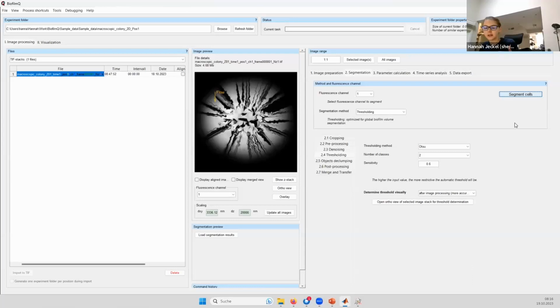Of course, if you have cells that are maybe from the same species but different colors, you would aim to have them represented as the same size. If you perform different types of filtering and thresholding, it changes the final size of your segmented cell, right? Because it becomes bigger if you lower the threshold. So you would aim to have a consistent segmentation. I think that's probably the most important thing, that the segmentation between channels is consistent so that your cells are represented in the same way, if that makes sense. Yeah, cool. Okay, so now let's go to the merging.